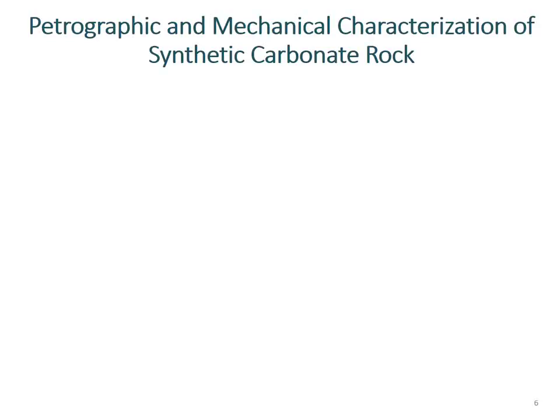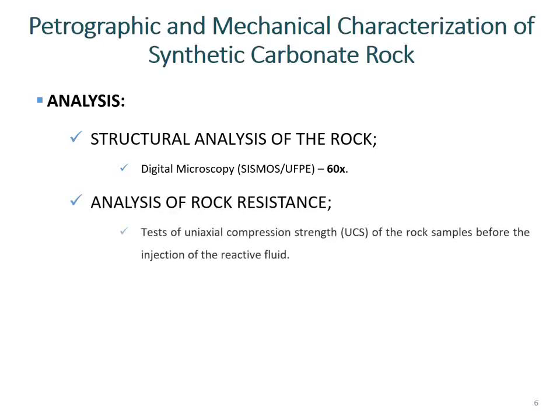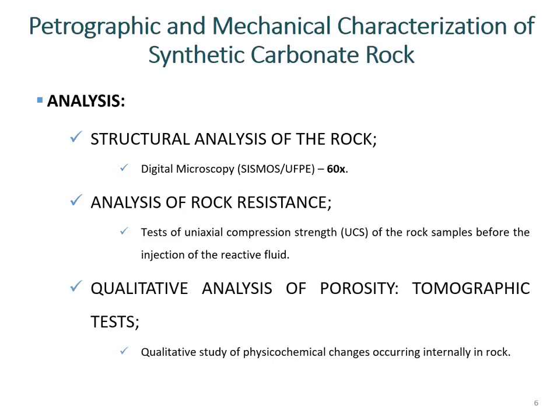Some analyses were performed for petrographic and mechanical characterization of synthetic carbonate rocks. A structural analysis of the rock with digital microscopy, analysis of rock resistance with tests of uniaxial compressive strength of the rock samples before the injection of the reactive fluid, and a qualitative analysis of porosity with a qualitative study of physical-chemical change occurring internally in a rock.